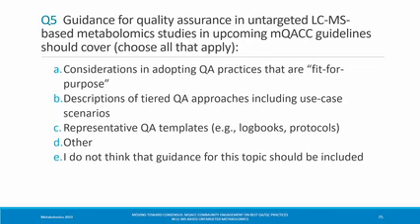I actually had a question about what that meant, because I was curious too, if there was a minimum or a universal thread in QA, QC practices, because it made a really great point for the fit for purpose. But did that tiered approach basically mean that the first tier would be the minimum, and then additional tiers are your fit for purpose? I'm going to let Matt answer that question.